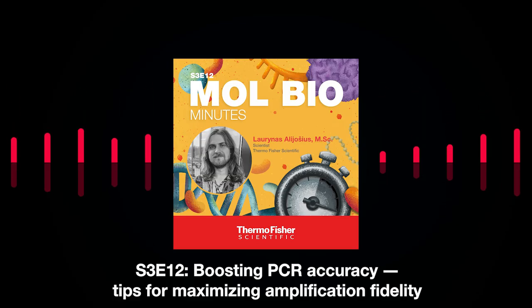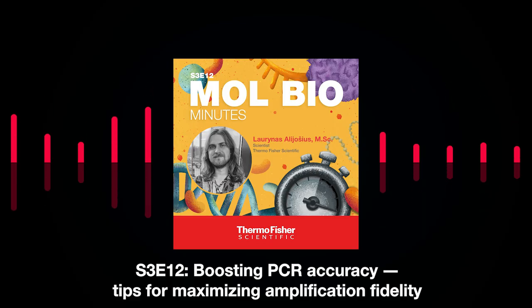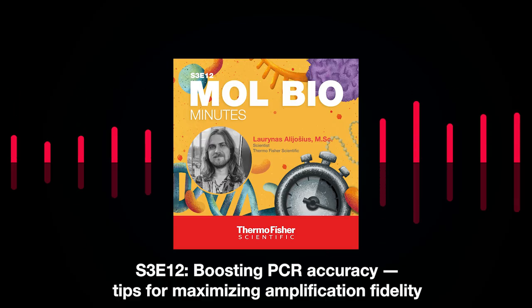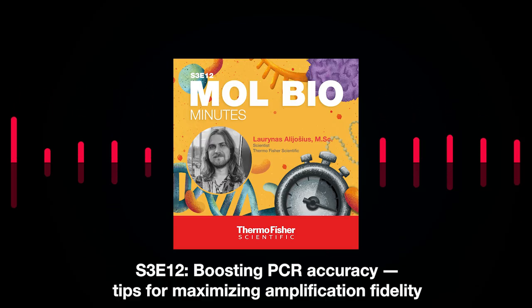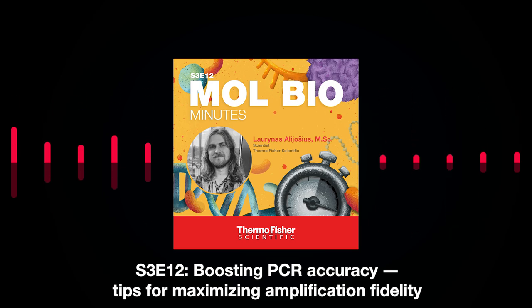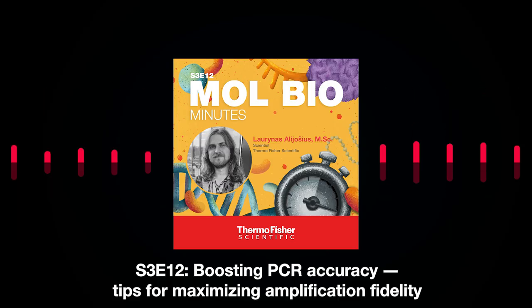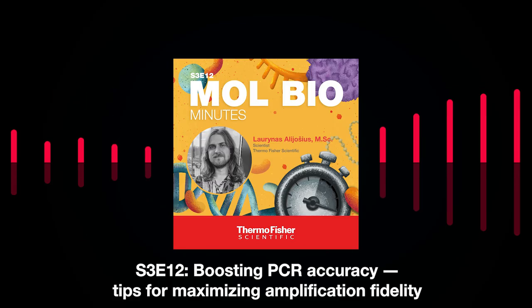So now that we got the PCR components ready, let's move on to the cycling conditions for the accurate PCR. Starting with denaturation. Try to use standard times according to your DNA polymerase or your master mix or the sample type that you're using, because for things like crude samples, you may need a bit longer denaturation time. But as I mentioned earlier, you don't want to have a very long denaturation time because that can cause some accuracy problems.